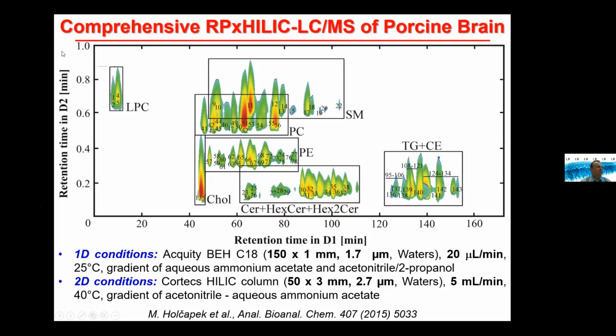The final chromatogram I'm going to show here is the comprehensive online coupling of reverse phase chromatography with HILIC. You see the coverage of the separation space here. But of course, this is quite technically demanding, so you need some experience with this methodology as well.